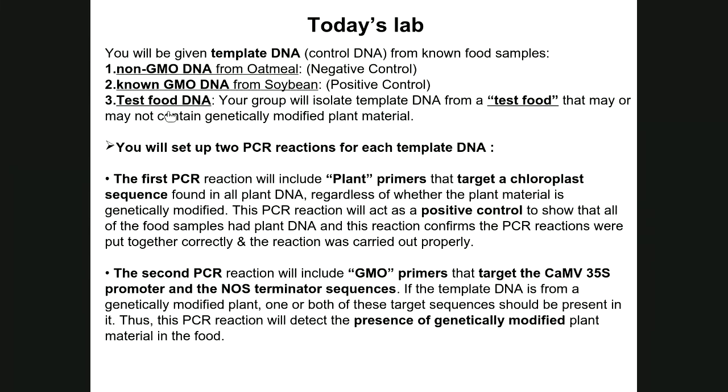Now, as I said, it's not enough to have your target or template DNA. You also have to have primers. And what would actually happen is each of these 3 templates, you would use for 2 separate PCR reactions, for a total of 6 PCR reactions.